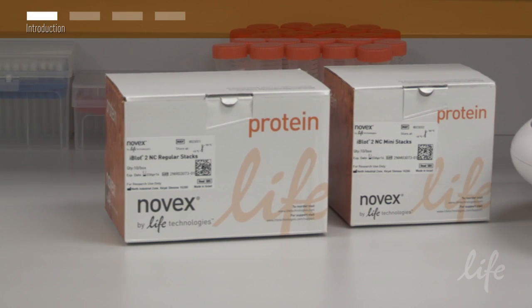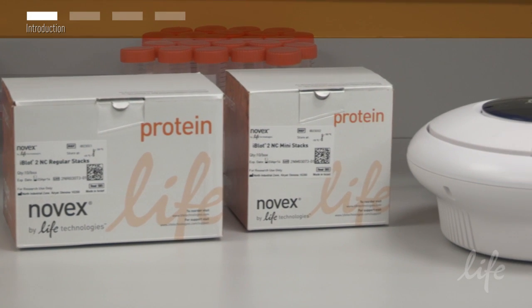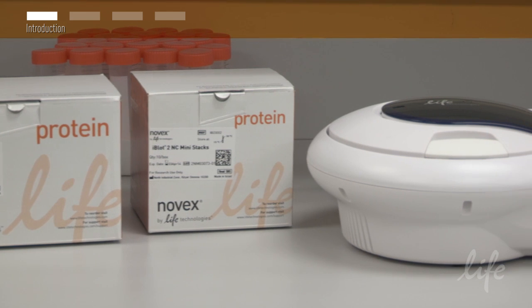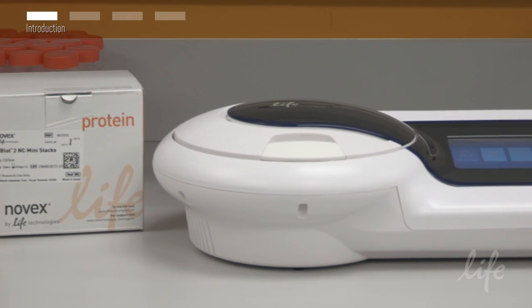Are you looking for fast Western blot protein transfers that fit into your busy schedule? If so, check out the iBlot2 dry blotting system.